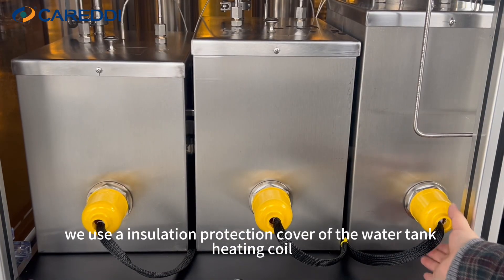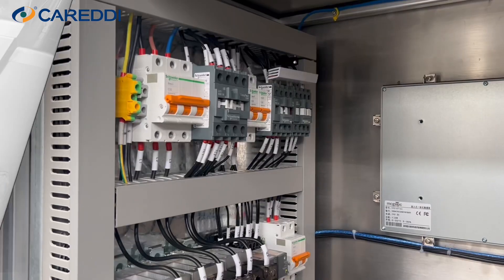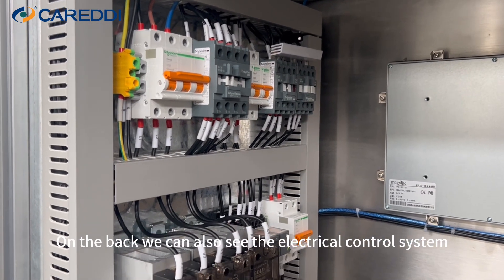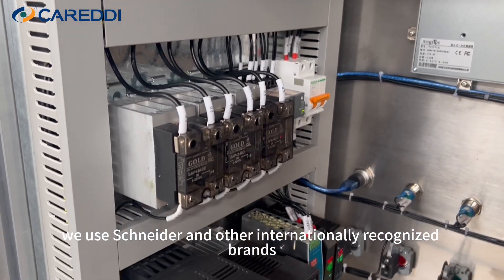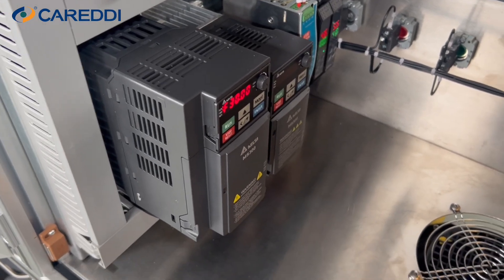In addition, we use an insulation protection cover on the water tank heating coil for easy maintenance. As for the electrical control system, we use Schneider and other internationally recognized brands for more precise control.